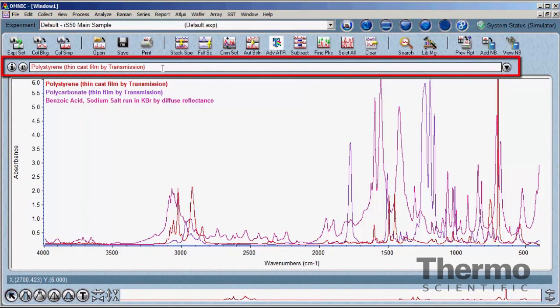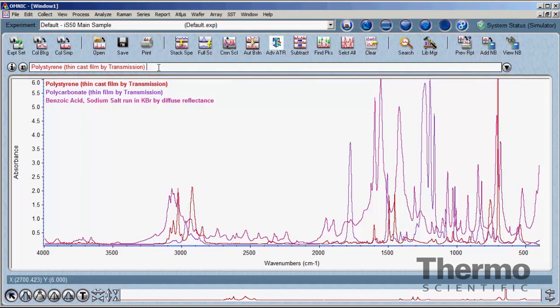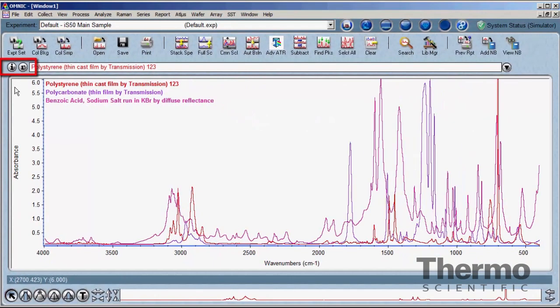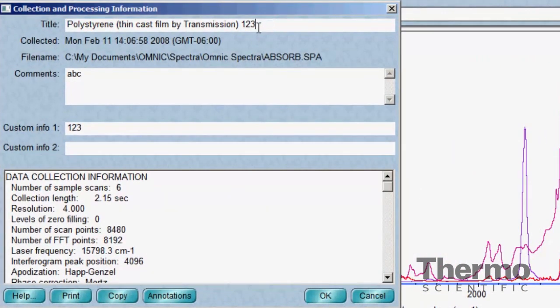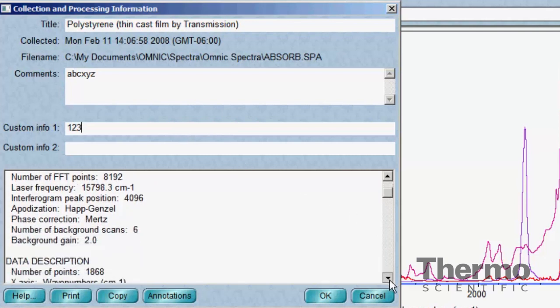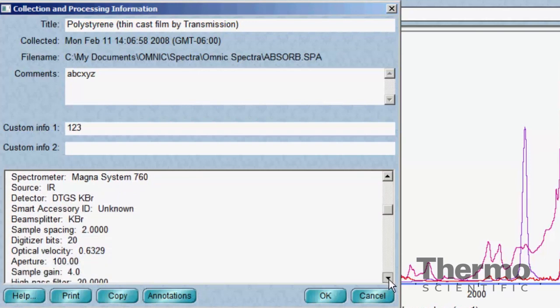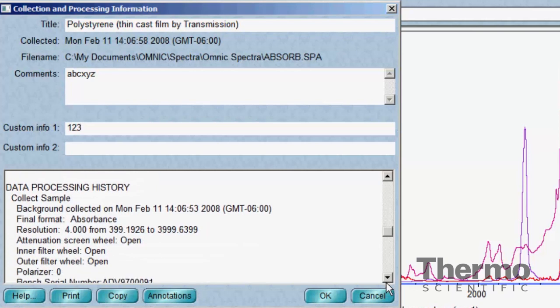Below the icon toolbar is the title region, called the title bar. The active spectrum displayed in the main spectral window will have its title displayed here, and the spectrum title can be edited on this bar. Two buttons to the left of the title, labeled I and R, will bring up windows related to the active spectrum. The I button opens the spectrum information screen, which contains all the settings used to collect the spectrum. The title field at the top can be used to change the spectrum title, while the comments and custom info fields allow entry of additional information. The scrolling region at the lower portion contains all the parameter settings used to collect the spectrum — this cannot be changed by typing and can only be copied. Any changes done to the spectrum will update the information at the bottom of this list in the data processing section.